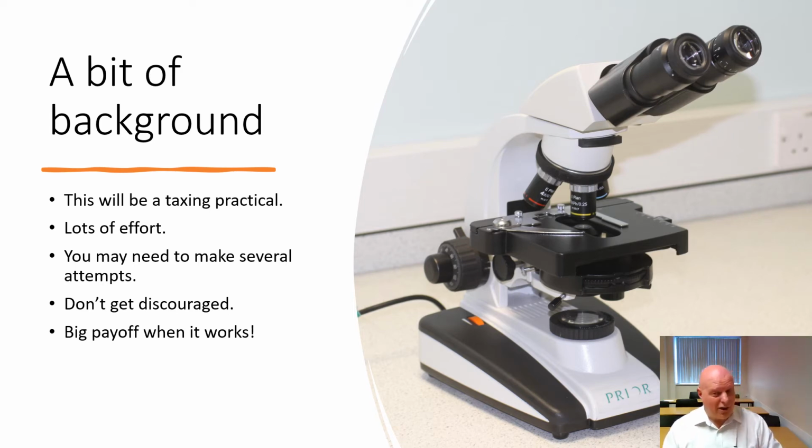You may need to make slides again and again and again, but do not be discouraged, because when it works, there's a big payoff in that you can get lots of data from a single slide. In fact, while I was preparing for this, I did a locust squash and I took over 200 pictures of stages of meiosis on the microscope. So when it works, it's brilliant. Do not get discouraged.